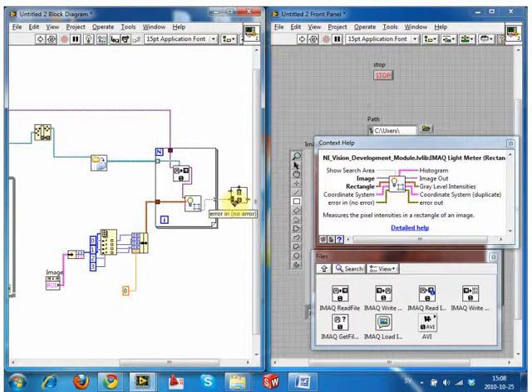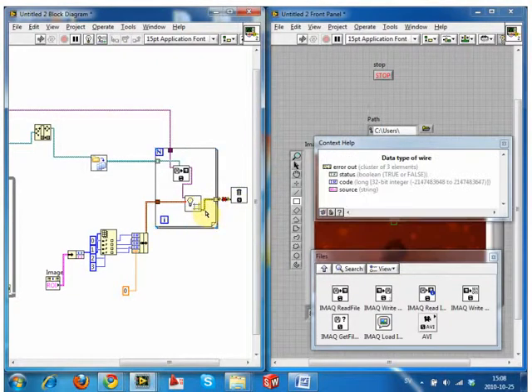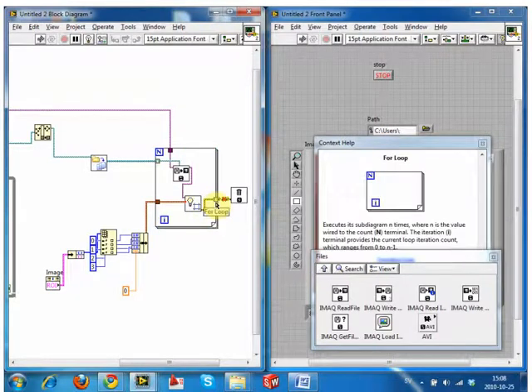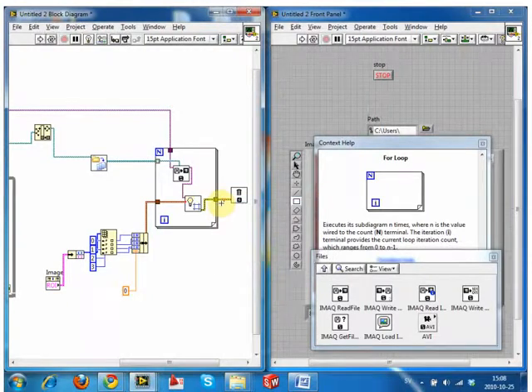But whenever you output something from within a for loop, it will automatically try to index it, because there's going to be a lot of items coming through. Essentially, what you want to say is, I don't need to know on what loop number the error came from. So you disable the indexing, and then it's fine. A lot of times there's no need to know that the error happened on file number whatever. It's more that there was an error, and that's all you really need to know. Doing it this way means that this will only be actioned after this finishes.